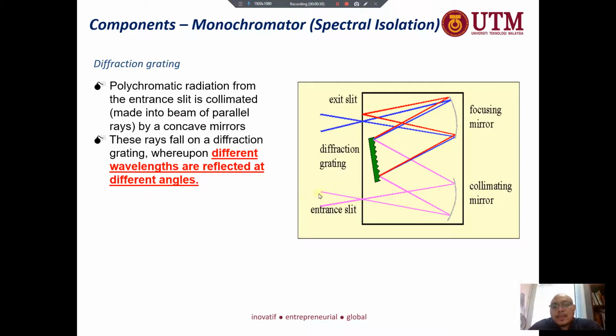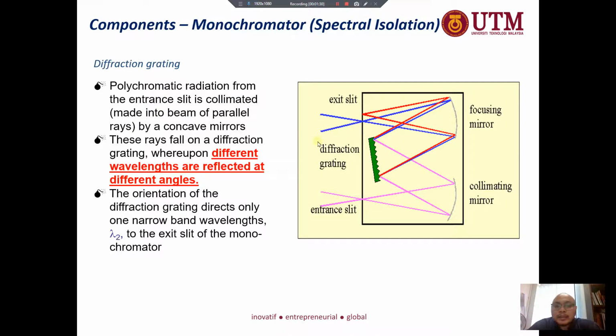Okay, so here we have the light source. The rays or the beam will be focused by hitting the mirror and then will be reflected to the diffraction grating. So the polychromatic light will be focused to the diffraction grating through focusing adjustment from the collimating mirror. Then after it hits the diffraction grating, it will diffract into different wavelengths. It will be separated into different wavelengths. So you can use any kind of words that you can easily understand. Don't memorize word by word in this slide.